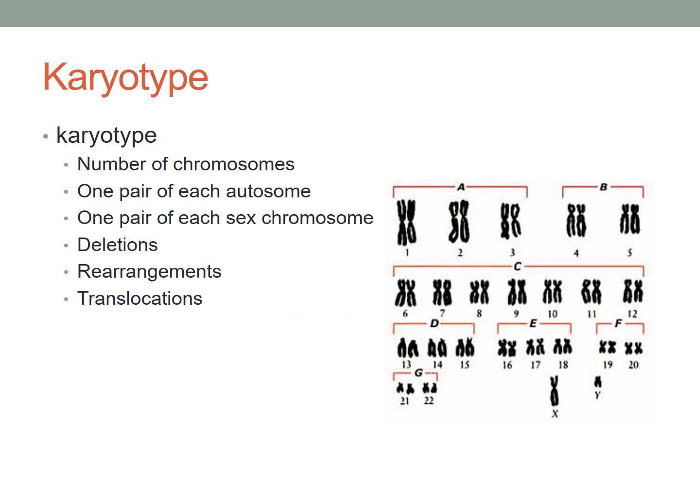Studies of chromosomes begin with the extraction of chromosomes from cells. The chromosomes are then placed on a glass slide, stained with dye, and examined under a microscope. Each chromosome pair is assigned a number from 1 to 22, and then XY, based on staining pattern and length. A karyotype is a representation of a person's chromosomes. The chromosomes are shown in pairs and arranged in order of decreasing size. Individual genes cannot be seen on chromosomes.